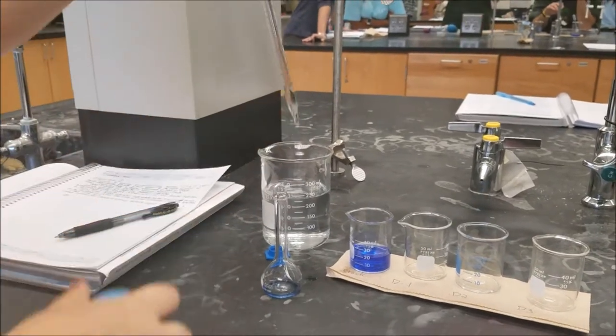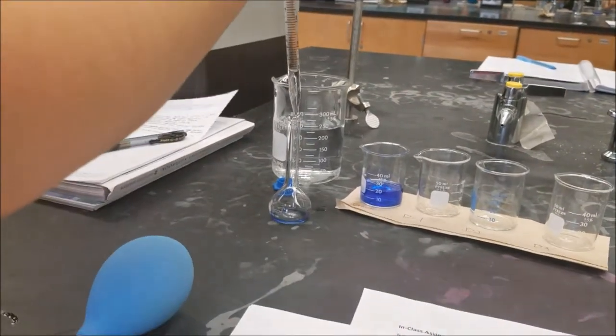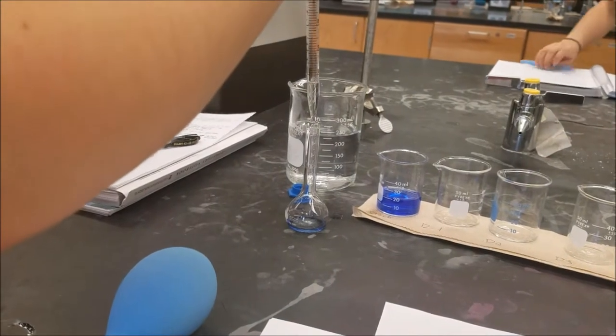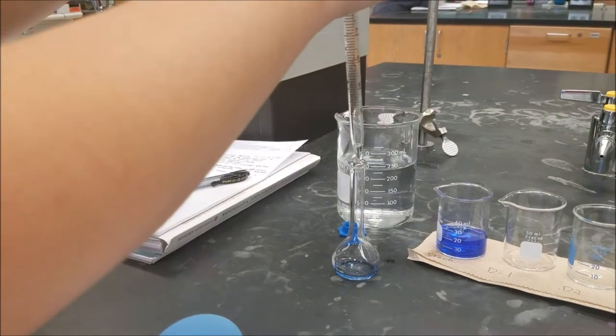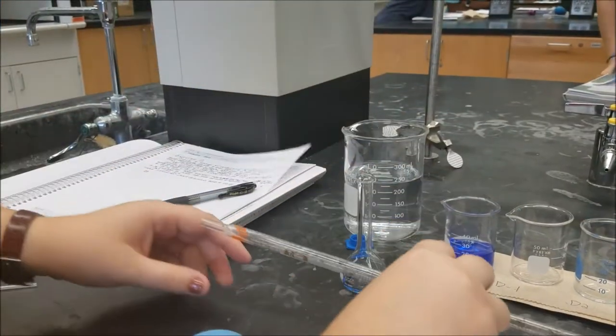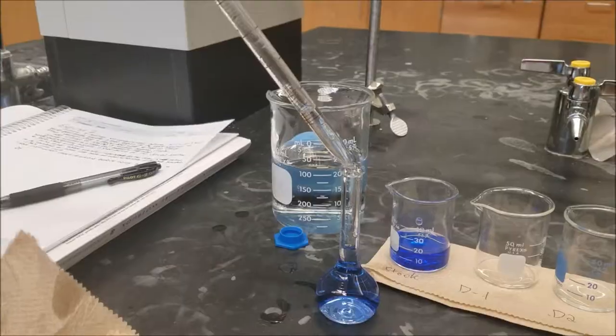Then, use the pipette once again to add water to the flask until the bottom of the meniscus rests on the line. If you pass the line, then you must discard the solution and make another dilution.